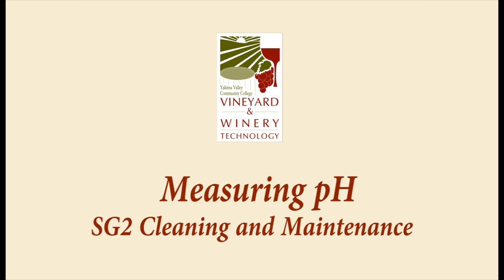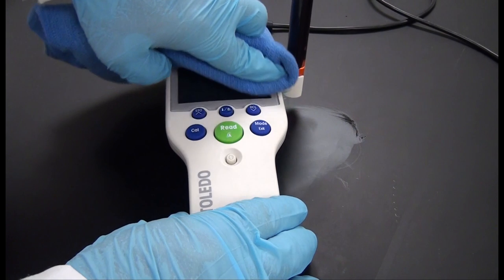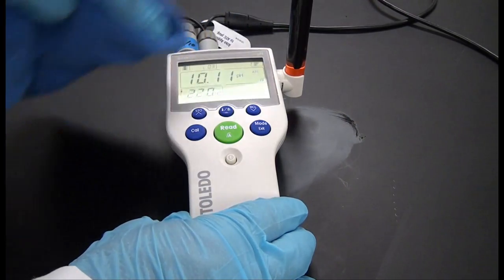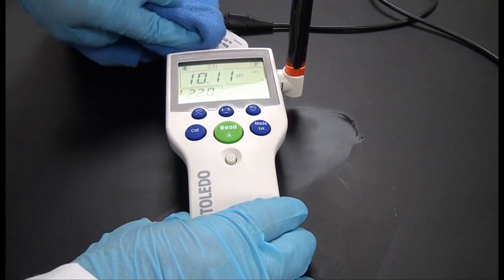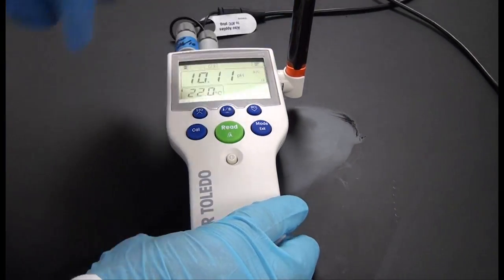The 7-go-meters do not require any maintenance other than a wipe with a damp cloth and an occasional battery replacement. The two halves of the unit should never be disassembled.